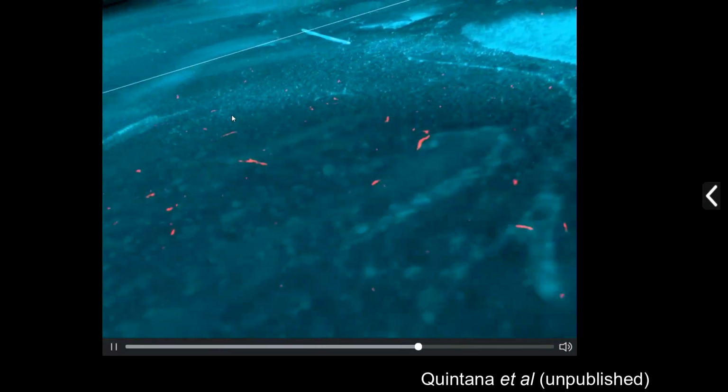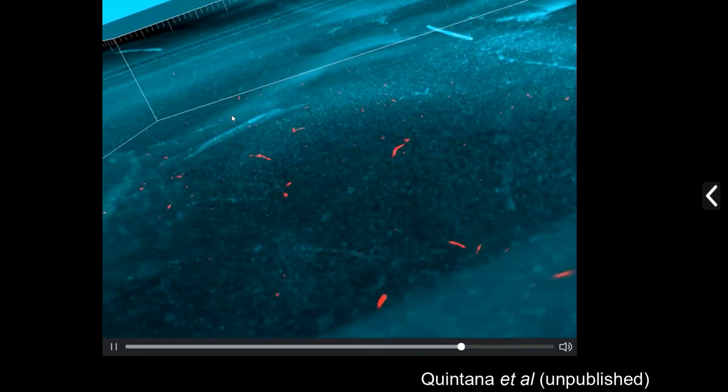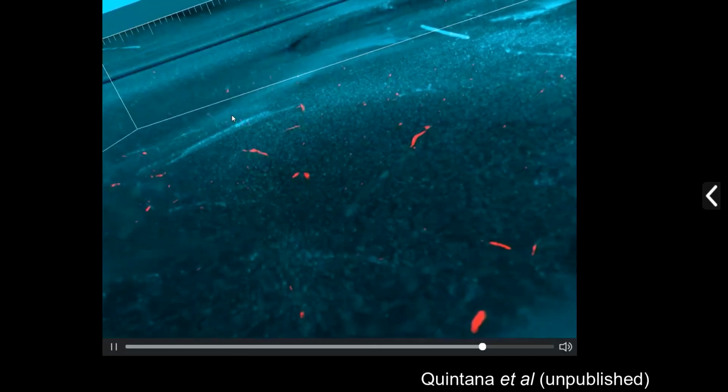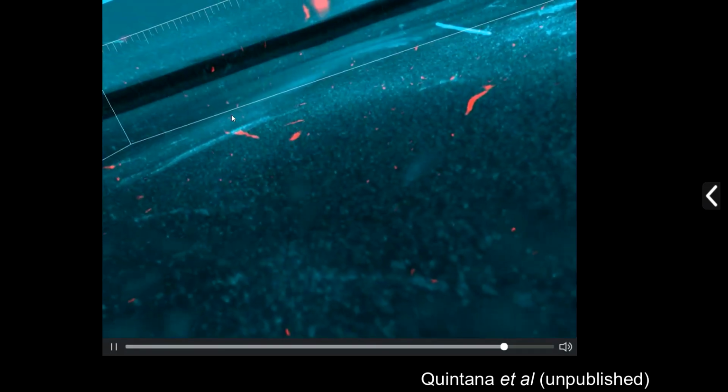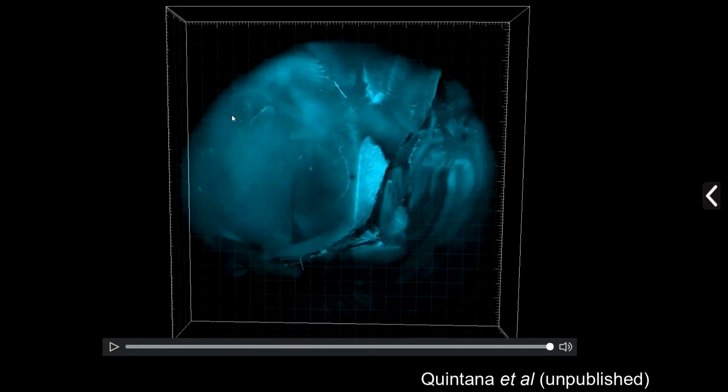But one advantage of the Mesolens, which we did not really anticipate here, was that it has the spatial resolution to stage the parasites and understand where they are in the replication in sexual phase. For example, these are short and stumpy, this one is elongated. So we can now start to better unpick exactly how the infection is spreading within the mouse brain.